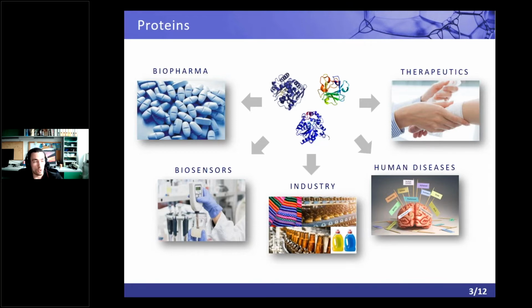So in all those applications that I showed on the slide, we work in a quite artificial environment for proteins. So we typically want to have them stable in some non-native conditions. And by stability, we mean that they are properly folded, basically. So why is it important?